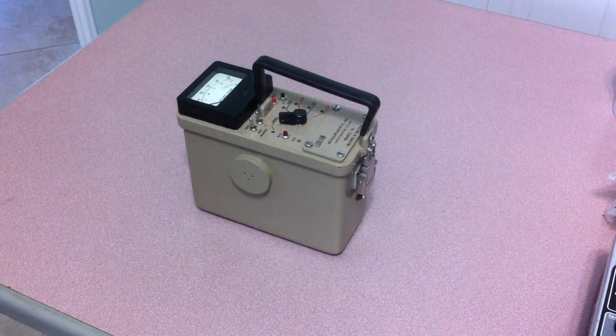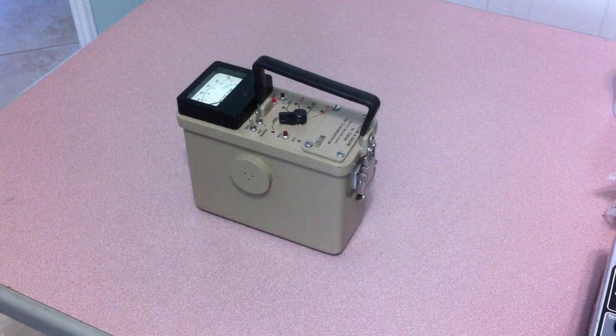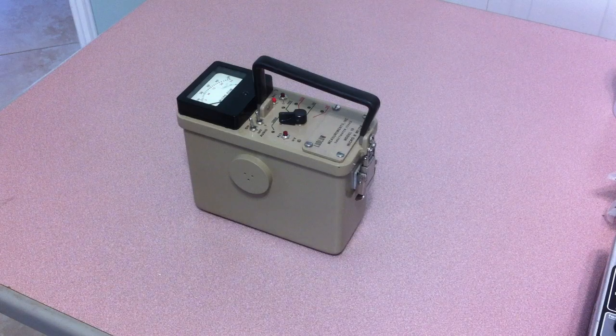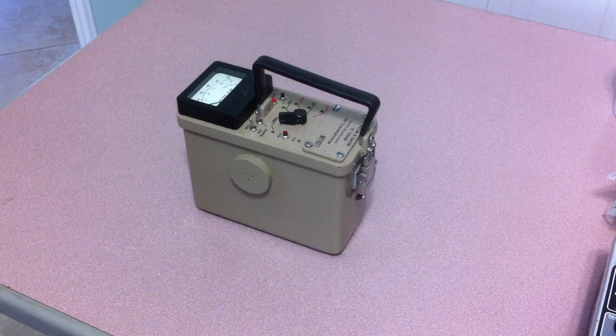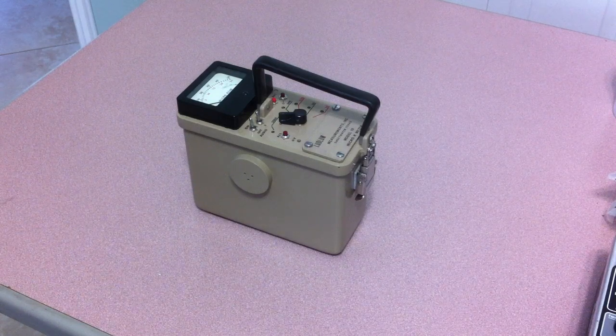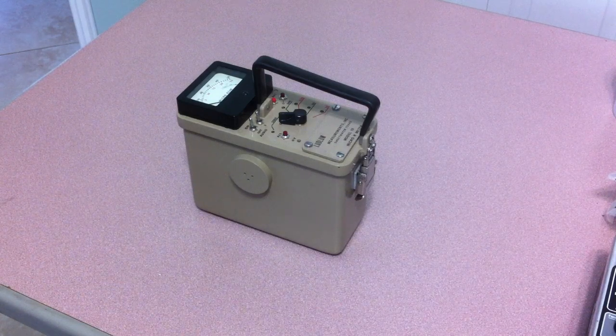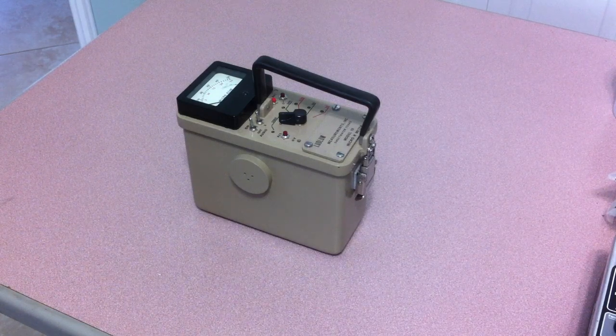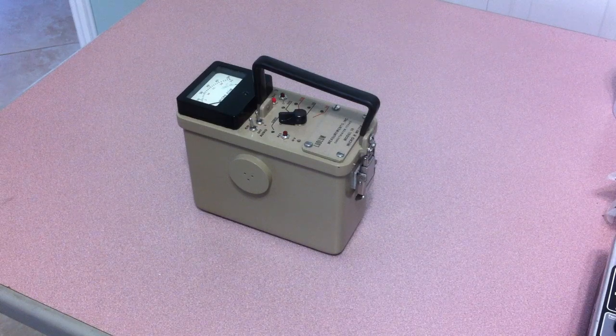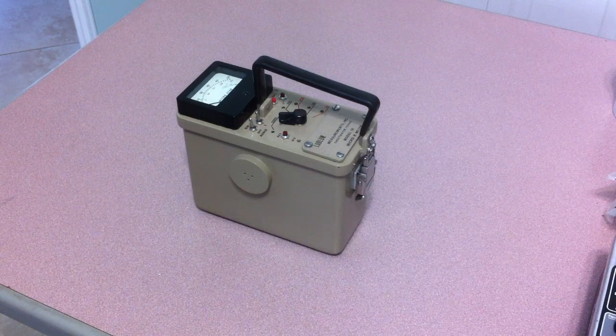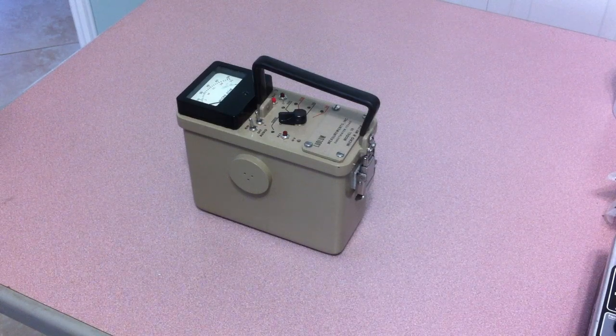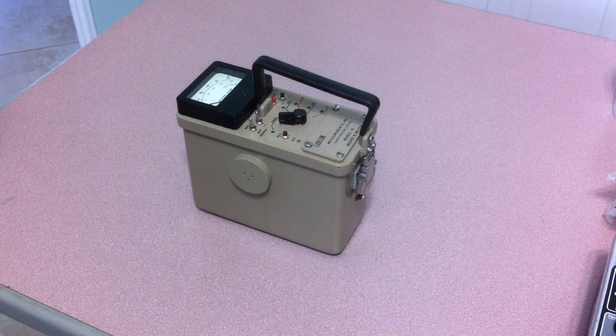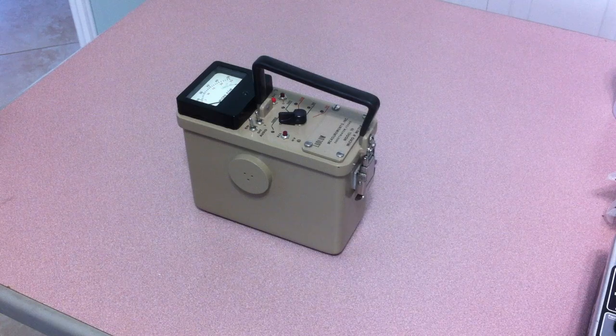Hello and welcome to the IRAD Labs. What you're looking at here is a Ludlam Model 19. This particular Ludlam Model 19 survey meter was fully refurbished here in the IRAD Lab.